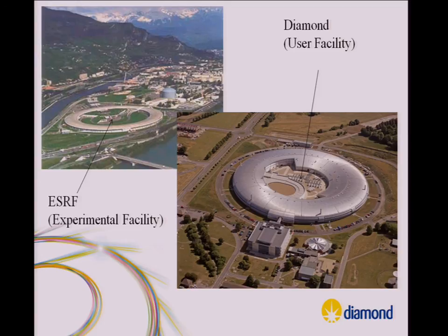For the main processing, you use the XY graph. If you know Eclipse Nebula, it's a library that aims to provide both RCP and RAP components. And did you choose XY graph because you plan to move to the web? Yeah, we would like a RAP version. We have a prototype for that. So it's in your future plan? Yeah, we have a prototype for it.